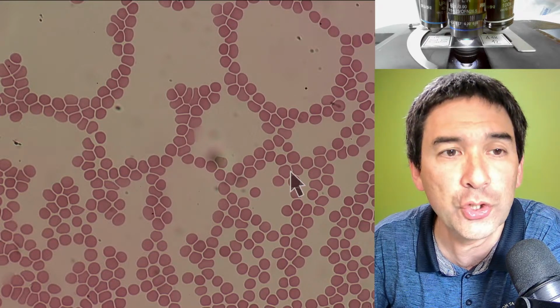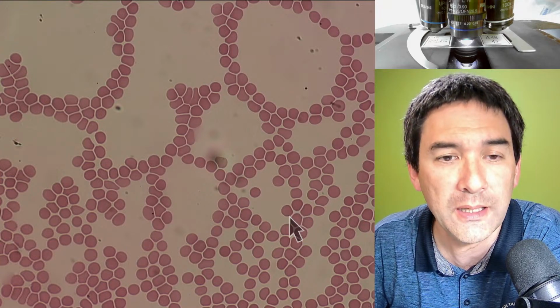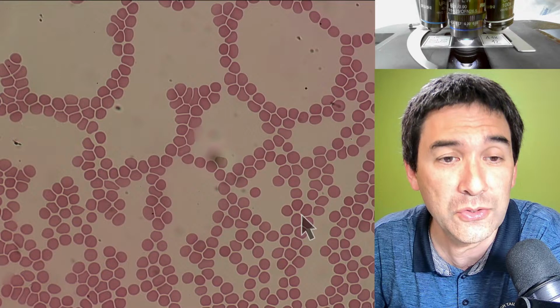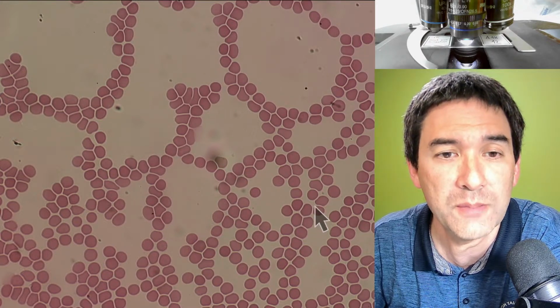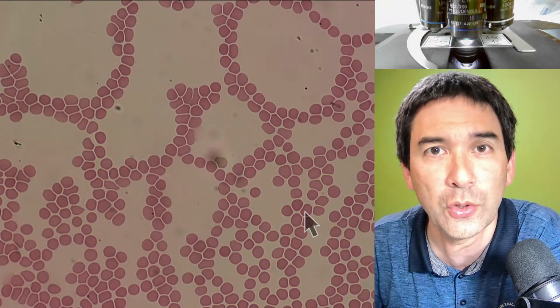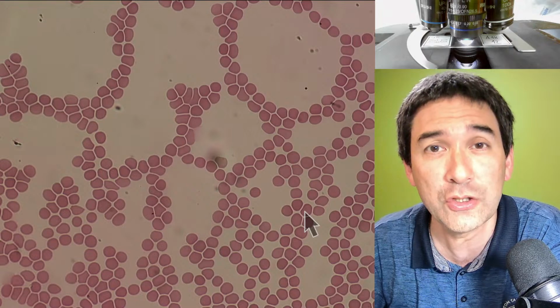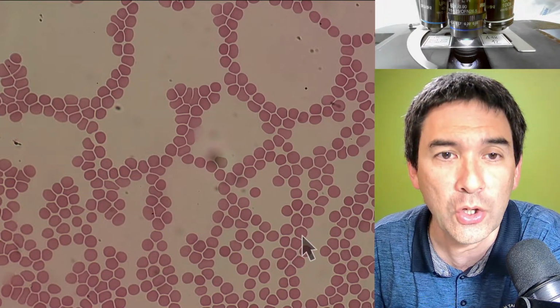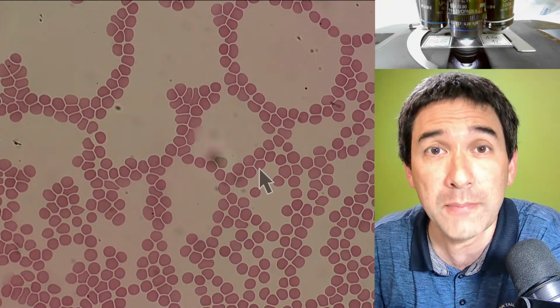This actually already shows that the red blood cells are extremely flexible, and that while they have a disc shape, they are able to deform a little bit. So that's one of the things that becomes evident here. This is actually an artifact. Artifacts are all of those things and structures that you see in a microscope that are actually not supposed to be there, right? And this deformation is because the blood smear, as you see over here, is dry on a microscope slide.